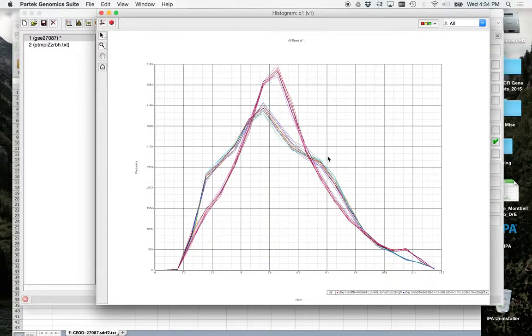So here, if I'm looking at this, what we expect in most of these cells, even these embryonic stem cells versus the pluripotent, is that most of the genes would be about the same. There's going to be maybe 1,000 or so that are different, but they should all have a similar pattern.